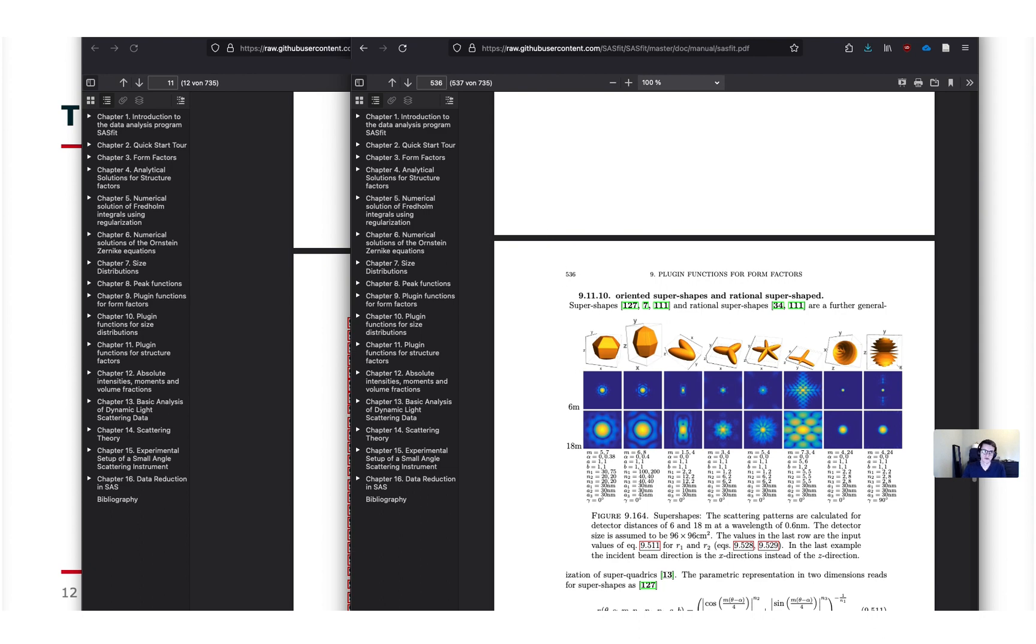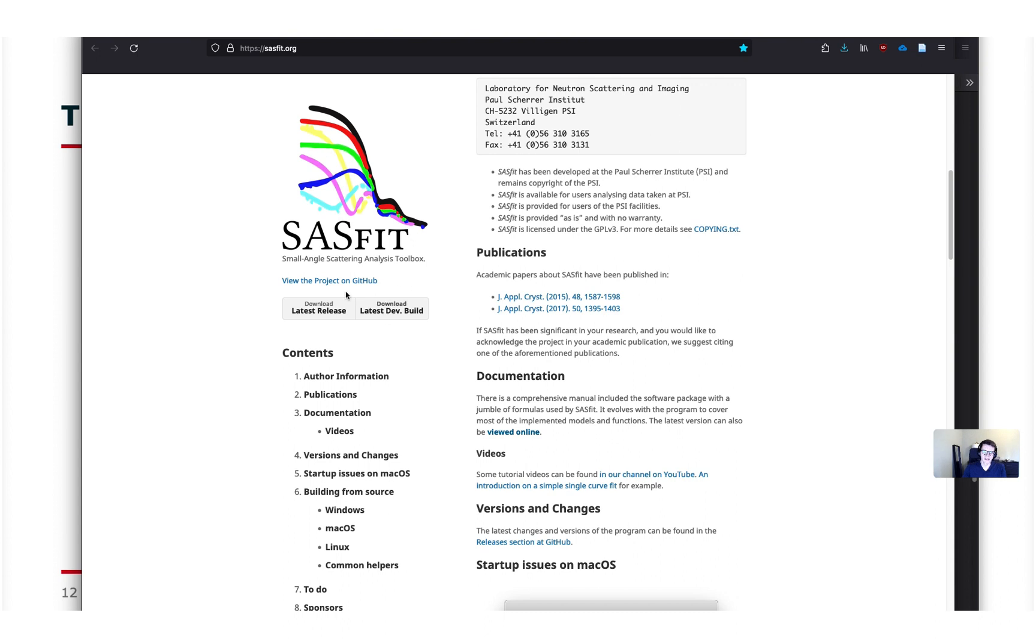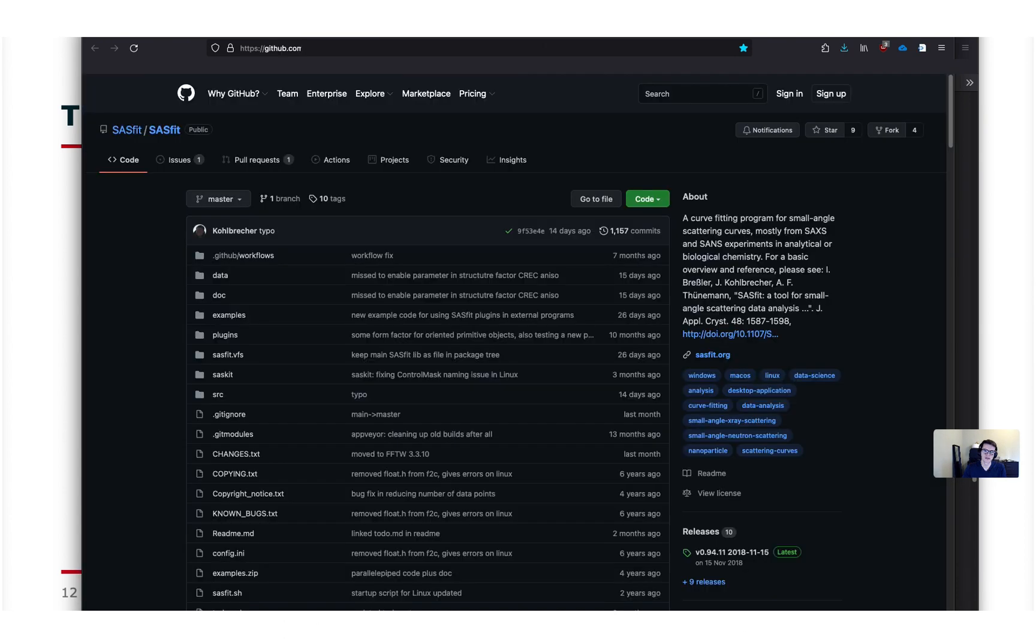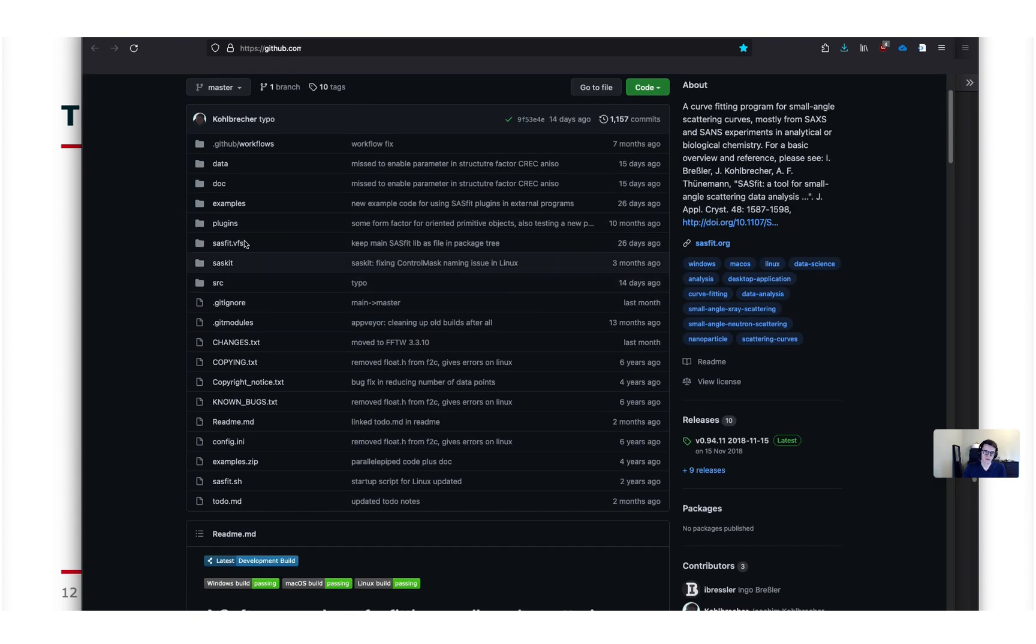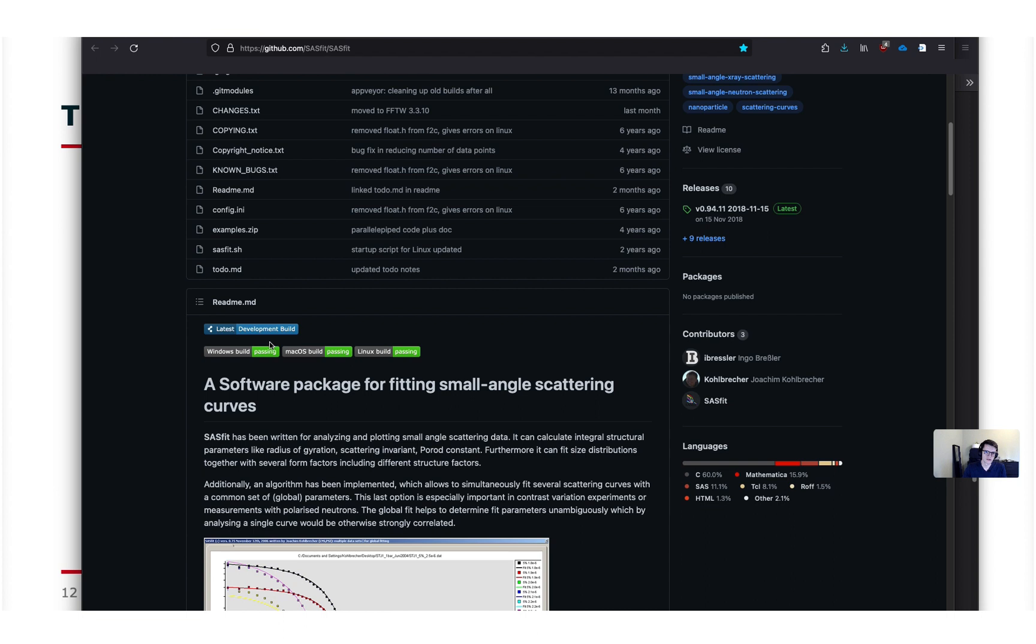So the last current version of the program can also be found of course on its web page sasfit.org I showed earlier. And here we can visit the git project page. It's basically the page hosting the full source code of the program. And there are also some links again to the automatically built development versions which get built with every single change of the source code. So at the moment the latest stable release is a bit old by now. But there are more recent development builds.